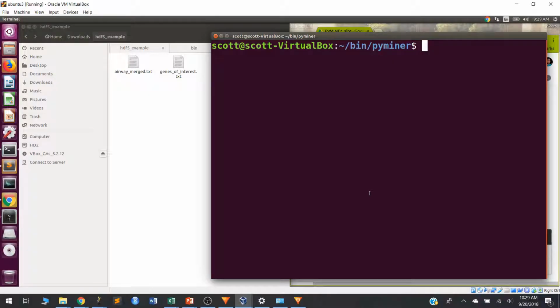Hello and welcome to the tutorial where I'll teach you how to use very large datasets with PyMINEr. Now, the dataset included in this example is just the same dataset that we used before, which is not a gargantuan dataset, but it'll act as a proof of principle.